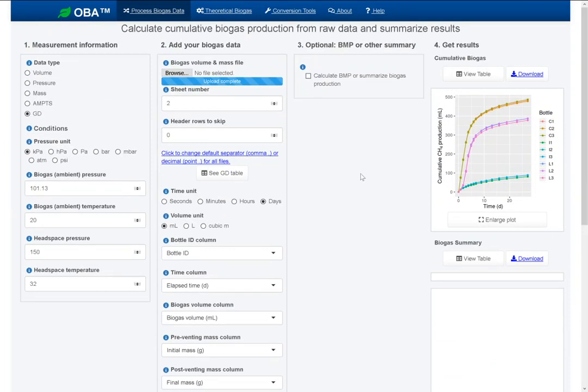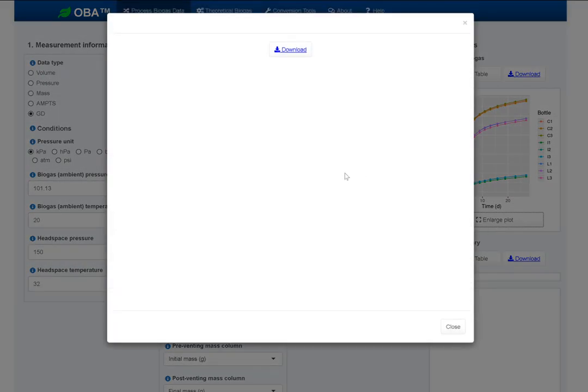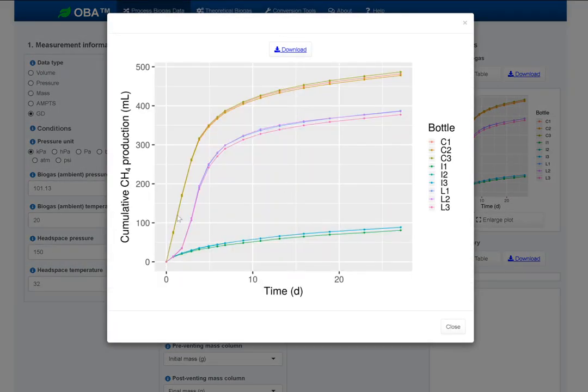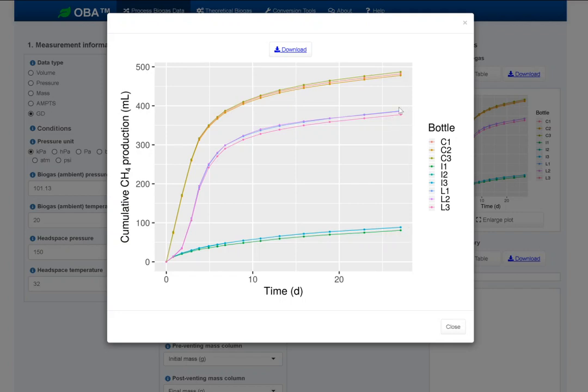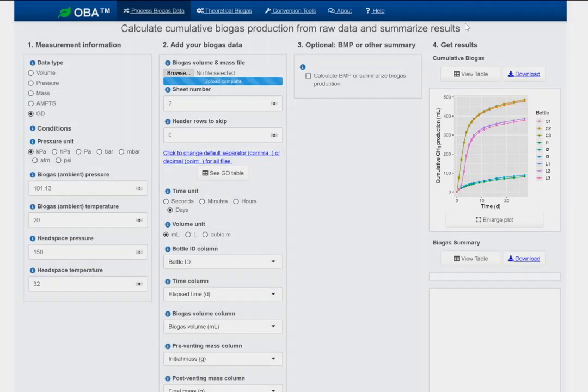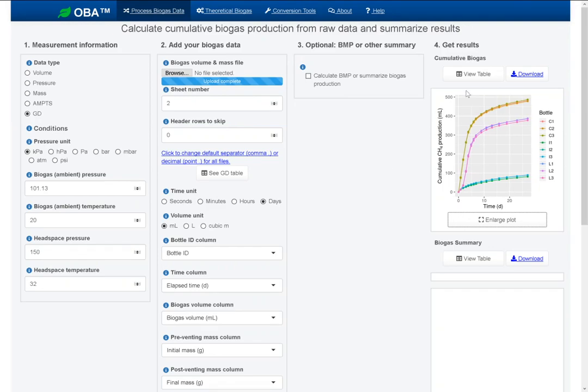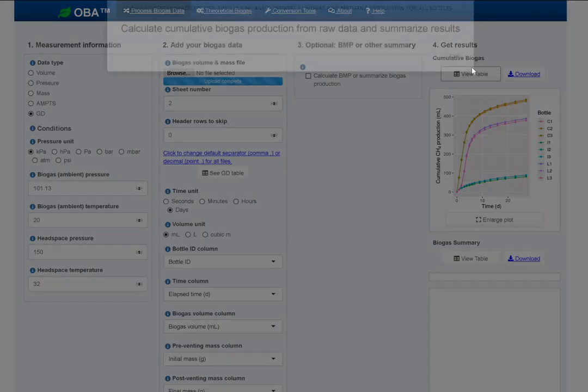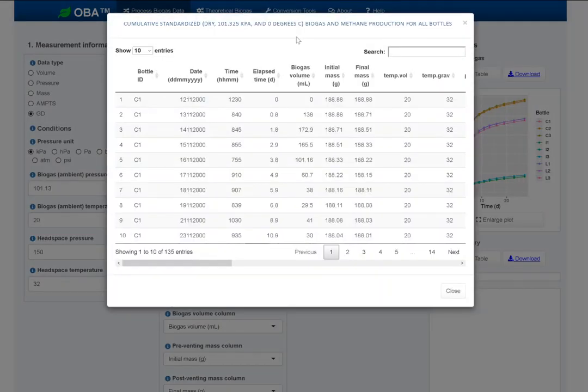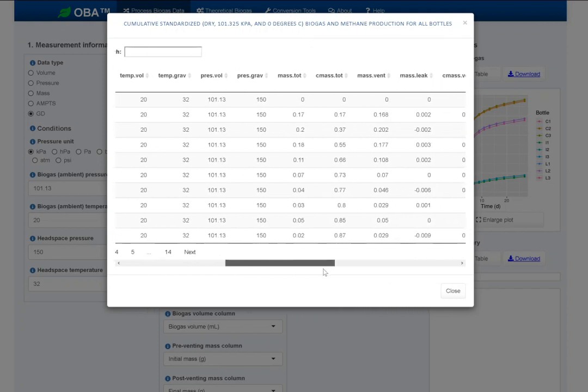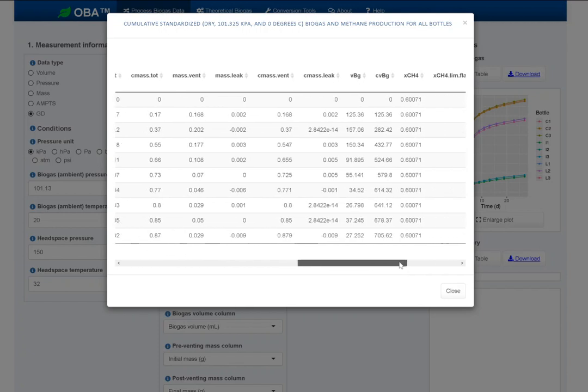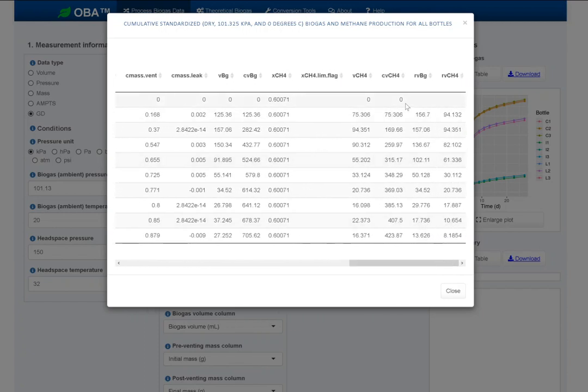Here's a plot of our results. We can take a closer look here. What's plotted is cumulative methane production in milliliters from each bottle. You can very clearly see that the three replicates for each condition, inoculum only here, substrate C here, and cellulose here, the replicates group together closely, which makes sense. We can look at the numeric values here and what was just on the plot.